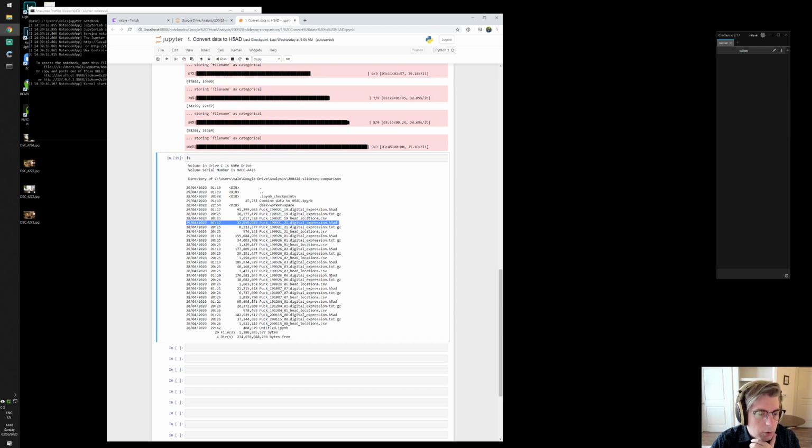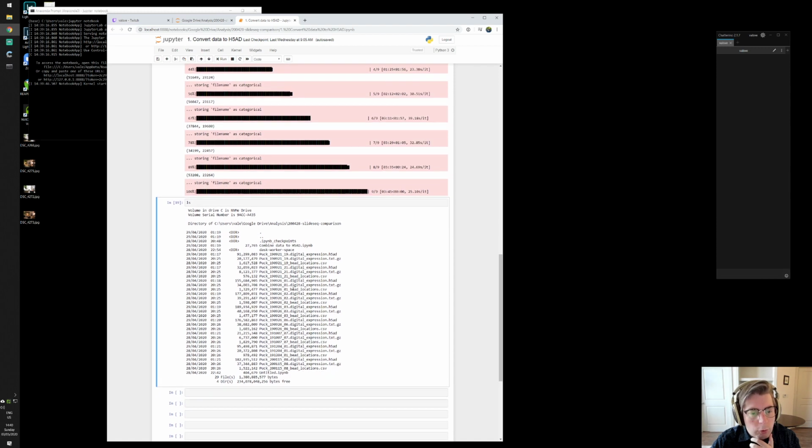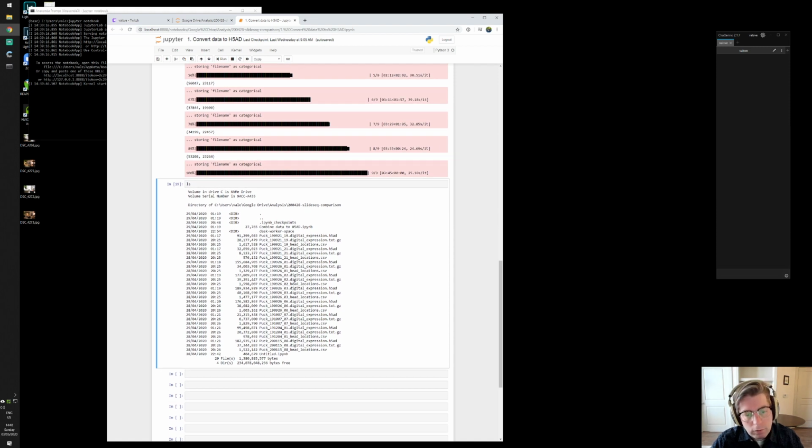So now what I want to do is add the annotated coordinates for the beads in these H5AD files, and then combine them into a single file so I can easily make a plot with a single file for the original Slide-seq data.